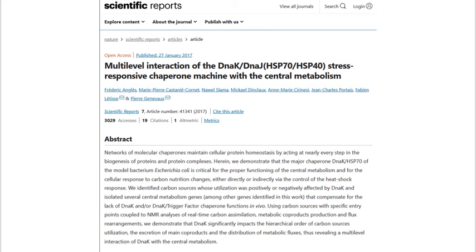String showed that this protein interacted with DNAK, another chaperone protein involved in chromosomal DNA replication, which was about half as abundant in the treatment samples. String gave this interaction a high score, so I began to read publications which I used to infer that the increase of TIG proteins and decrease of DNAK proteins was in response to the ampicillin, potentially indicating that the treatment E. coli was downregulating the genes involved in cell replication and upregulating TIG in order to remove aggregated proteins being either directly or indirectly inhibited by the beta-lactam antibiotics.